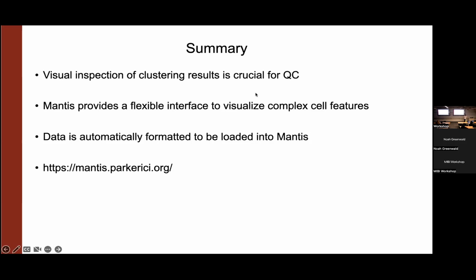So this is used to identify problems, but then you have to go back and change your clustering to actually fix the problem. Maybe that means when you made your pixel meta cluster, you accidentally included an individual pixel cluster that should have been tumor cells into the immune cell meta cluster, or vice versa, or something somewhere went wrong. This is good for diagnosing the problem. I would not recommend using it for fixing the problem, because then you have to do it across every single image.